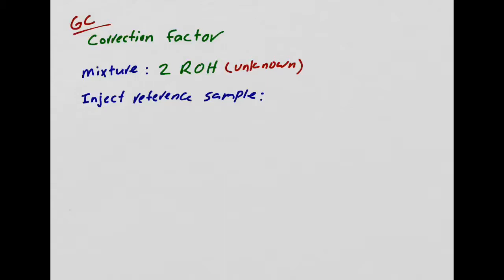It has all the suspected unknowns in it. What that means is it's got 5 unknown alcohols. And yours is 2 of these.